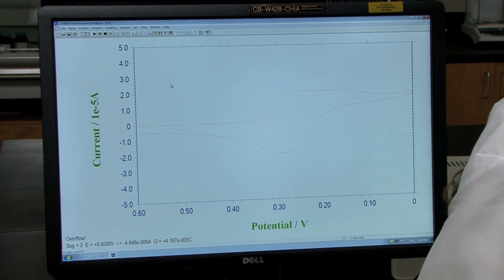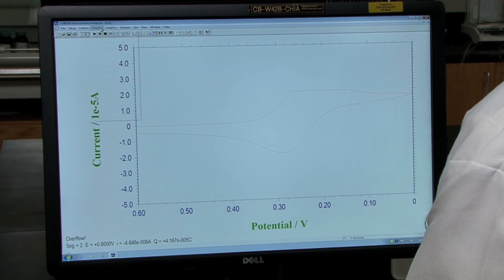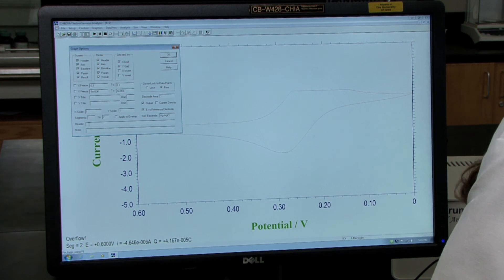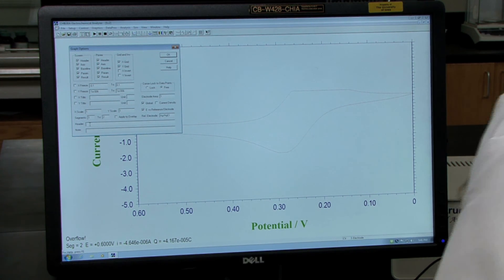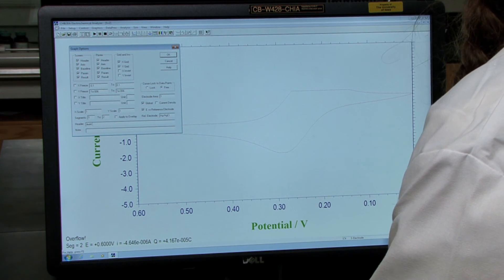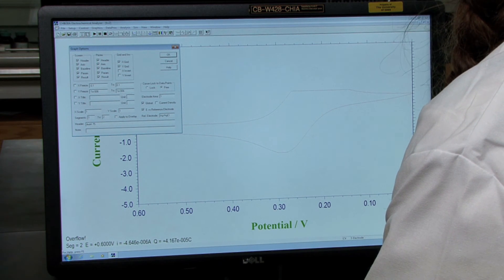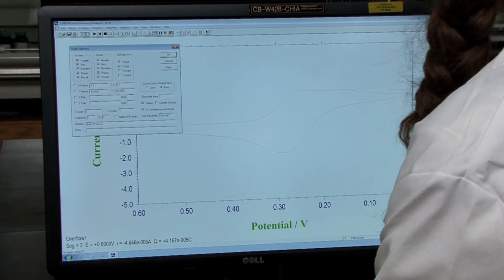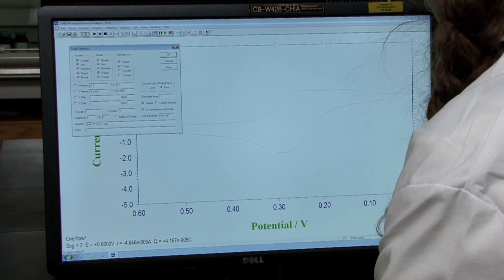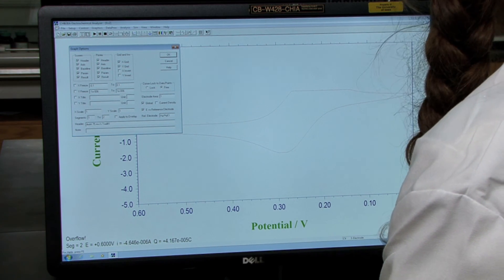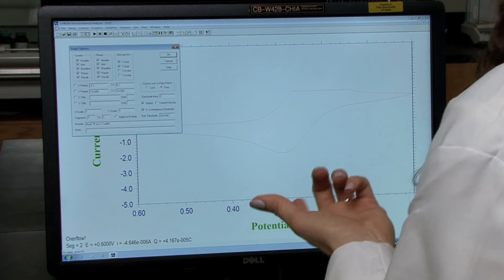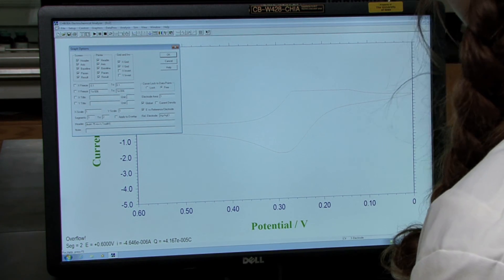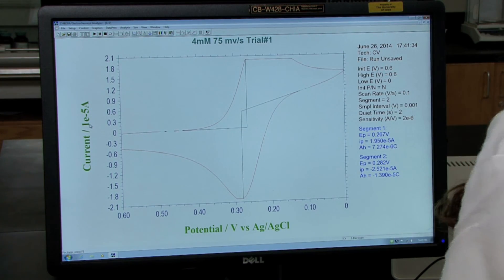We want to give the graph a title. To do that, go to the file menu bar, scroll down to graph options, and at the header bar you can type the name of your graph. I recommend typing the concentration of your solution, the scan rate at which you took it, and what trial it is, since you'll be doing three trials of each solution. Make sure you don't include any decimal points or periods in your title, otherwise the CV will not save properly. Once you're satisfied with your title, hit enter and the title will appear on top of your graph.